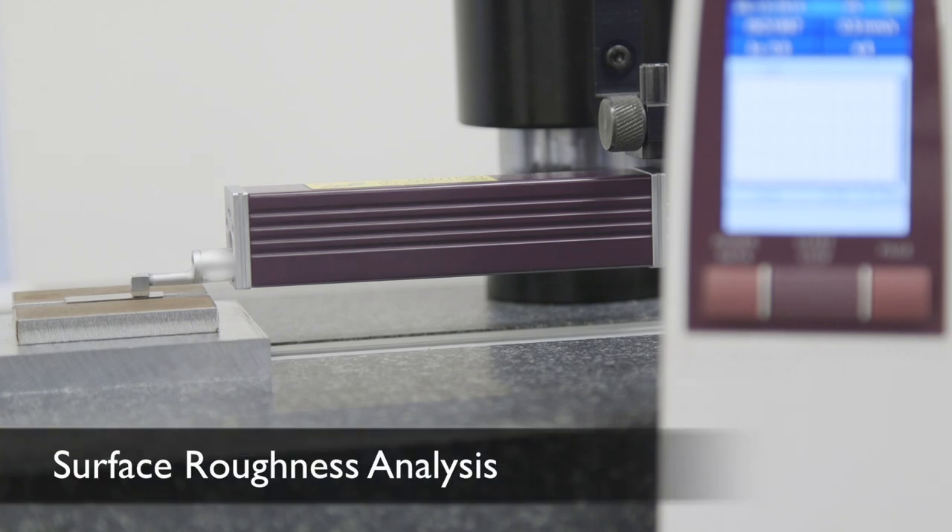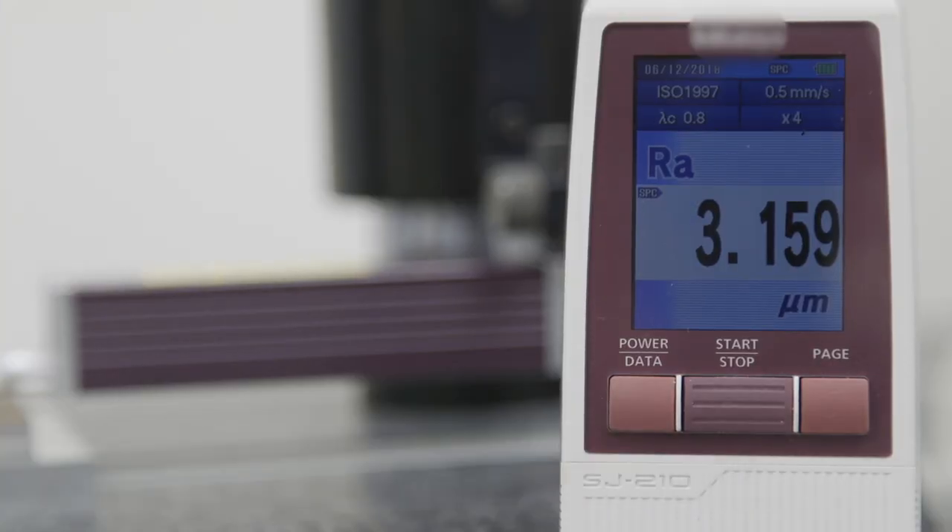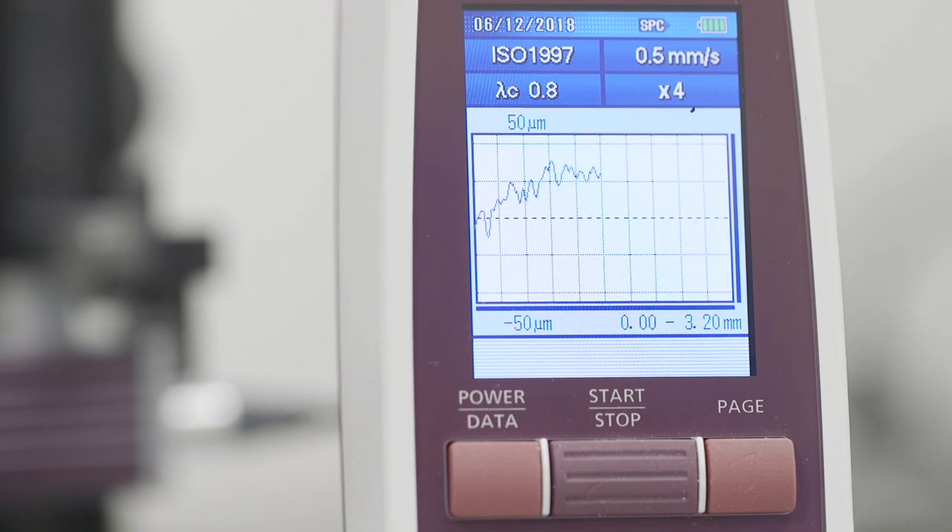This is a stylus profilometer, a contact-type method of measuring the surface roughness of materials, and it is currently measuring the surface roughness of the stainless part that we have cut. In this case, the straightness of the cut wall and the surface roughness is meeting the customer specification.